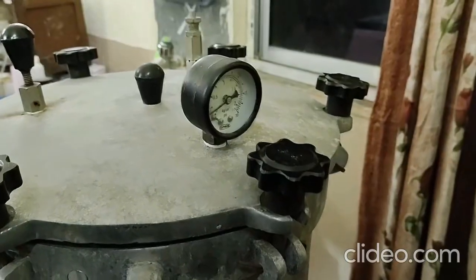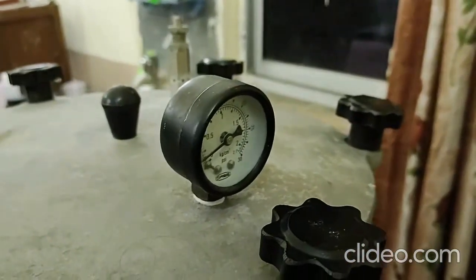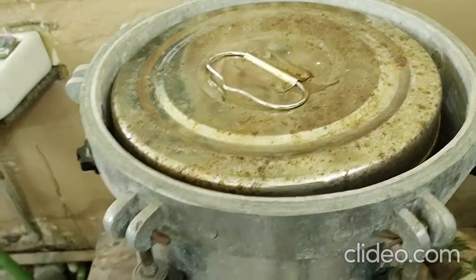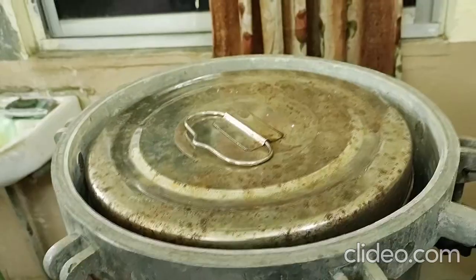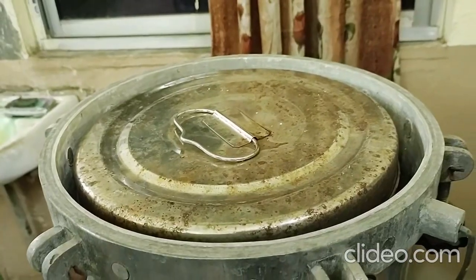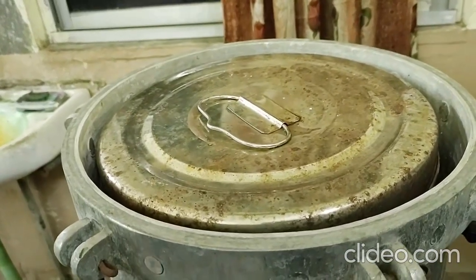Then the autoclave is switched on and we wait until the pressure reaches 1, and then it is kept at 120 degrees Celsius for another 6 hours. Then the beaker solution is taken out from the autoclave and repeatedly washed with alcohol and ethanol, and then it is filtered. Then the sample is dried at 60 degrees Celsius and then annealed for 2 hours at 350 degrees Celsius. We achieve the final product, that is the nickel cobaltite nanowire.